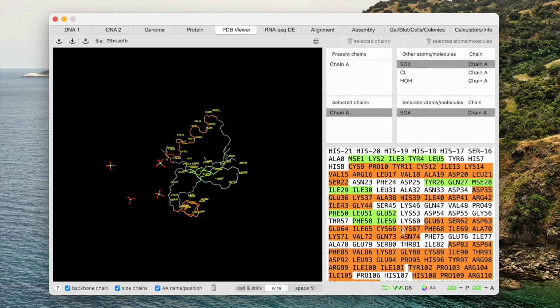To improve the prediction, for example, we can, let's close this, we can add secondary structure motifs from this protein to the database, not default, but custom database. And next, when we will analyze proteins similar to this protein, with high probability, we will have much better prediction. And to do this, just to put the secondary structure motifs from this protein to our database, we should use this button.